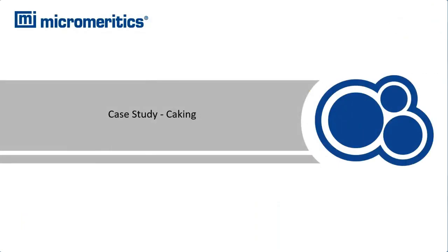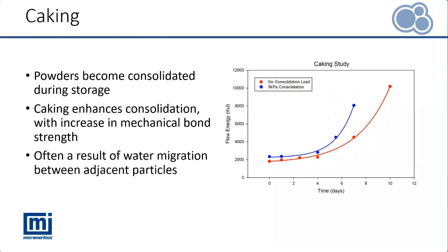And moving on to the second case study here, on caking. During storage, powders can become consolidated, which can then start to lead to caking as the mechanical bond strength between particles starts to increase. This is often due to water migrating between particles which are next to each other.